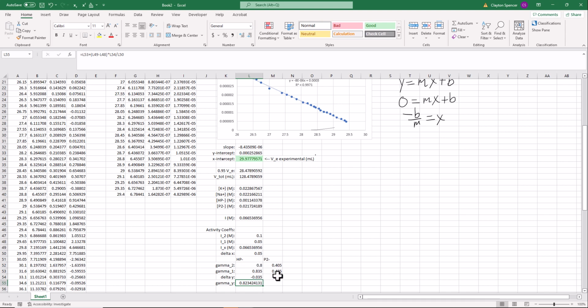Okay, so now since we've entered our values in this right-hand column, we can just click and drag this formula over here. Uh-oh, it didn't like something. Oh, I know what it did. When you copy and paste formulas, sometimes things go awry. We need to lock down our cell references up here in this bit, or you can just copy and paste them over here as well. But we'll just lock them down.